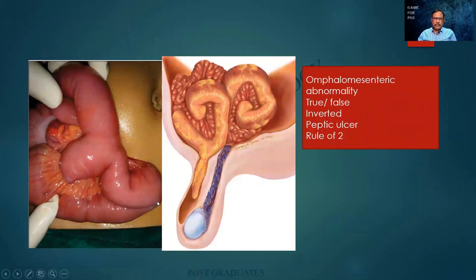Look at this. Another one. I am not an orderly person. I tend to divert or deviate. So there is a diverticulum. What is a diverticulum? A diverticulum is nothing but a deviation. In fact, you can say the appendix itself is a diverticulum. So in this case, I find that there is an intestine and then part of it is getting diverted out. It happens to have a blunt end. So it is supposed to be a vitello-mesenteric abnormality.